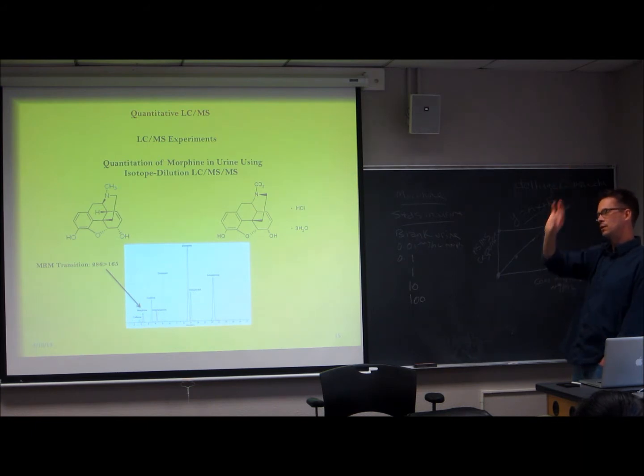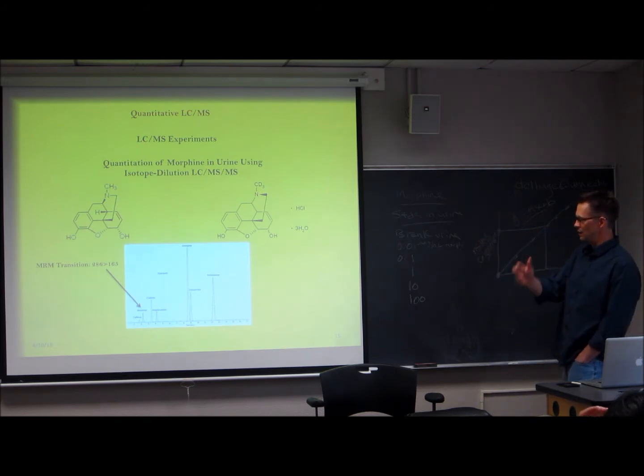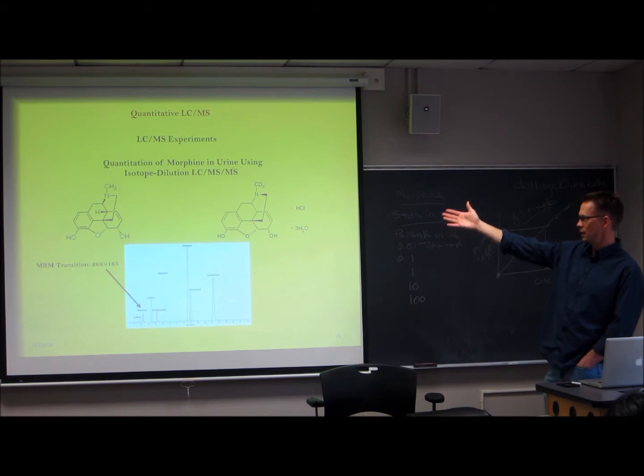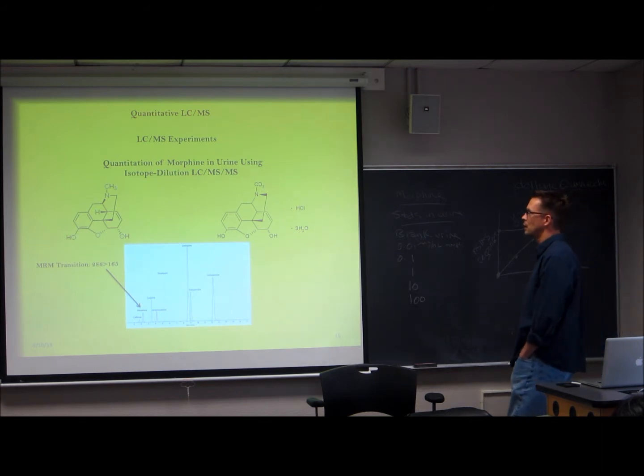So they're going to co-elute through all of your sample prep, through all of your wet chemistry, everything you do prior to analysis using the mass spec, it's going to behave identically to the analyte of interest. So if there's matrix suppression, there's going to be equal suppression of your deuterated internal standard as there is of your unlabeled standard, so that the ratio of those two will remain unchanged.